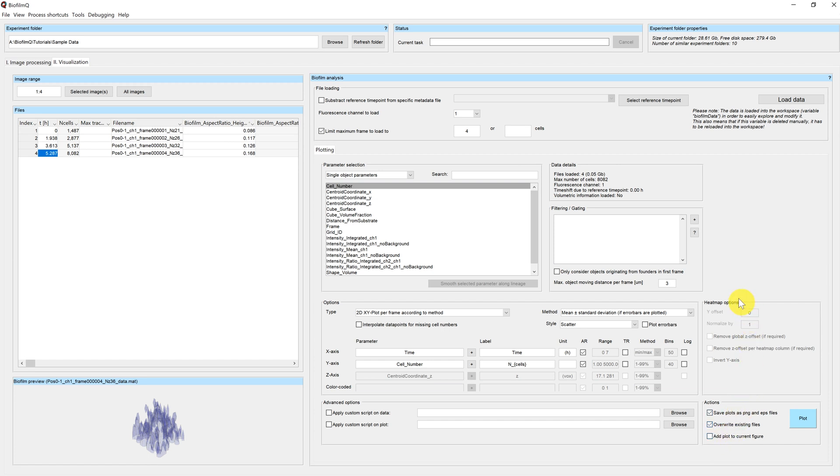So now you have gotten an overview over the different parts of the visualization tab, and other tutorials will discuss each of them in particular.